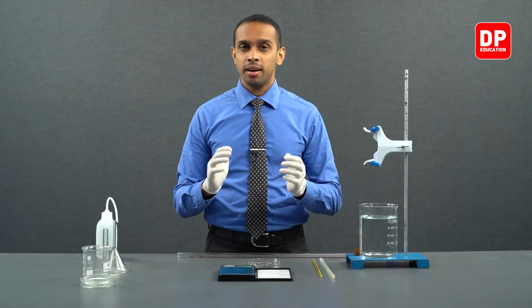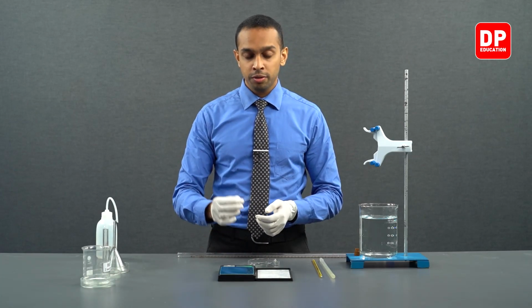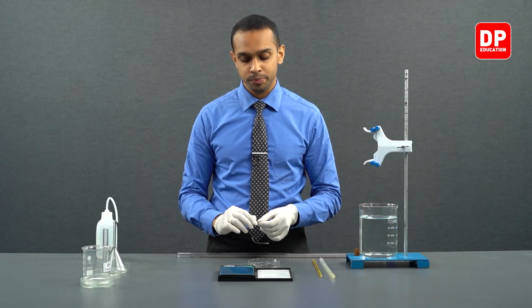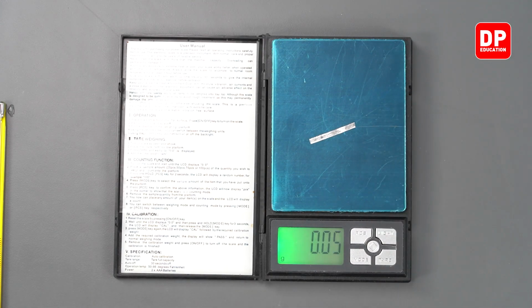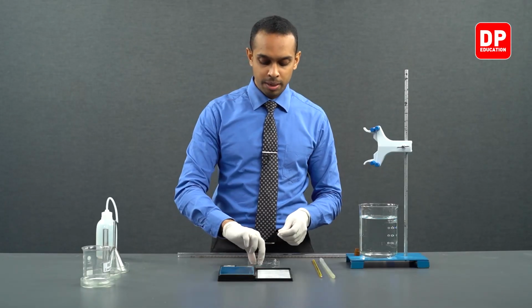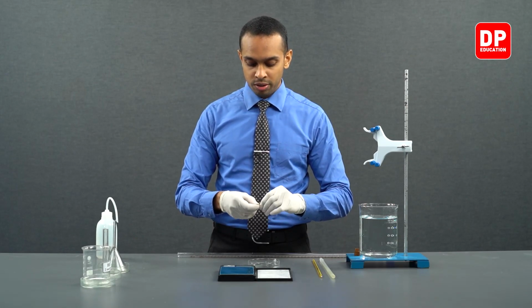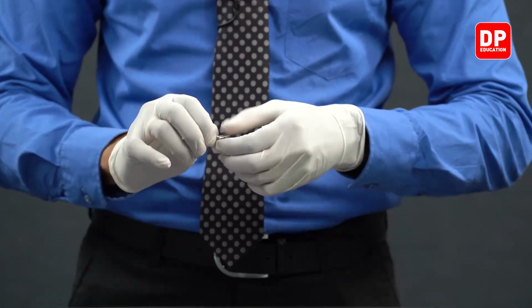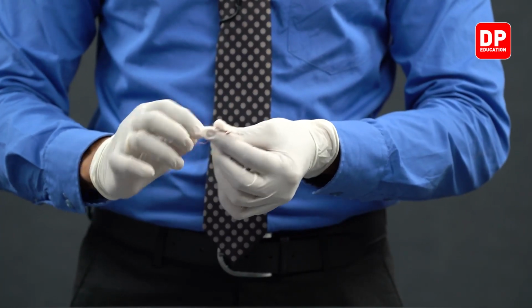We have come to our third and final trial. So when we are starting this trial, we are going to first measure the mass of the magnesium strip we are using. We have our digital balance here. Let's place it on the digital balance to see if it is 0.05. As you can see, the mass of the magnesium strip is 0.05 grams. Just like in our previous steps, let's take our copper wire and tie it around this magnesium strip like this, and we'll set it aside.